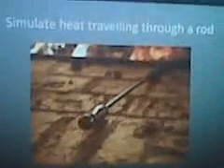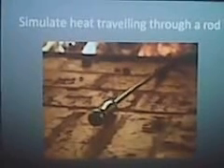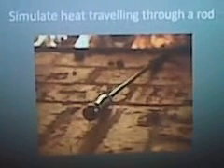These equations are complicated, beyond a first introductory course in chemistry. However, if you could describe or simulate heat traveling through a rod, Fourier transformation helps to enhance our pictures in the same way.